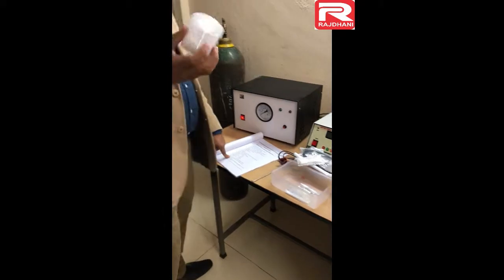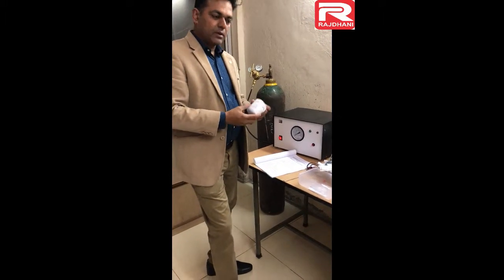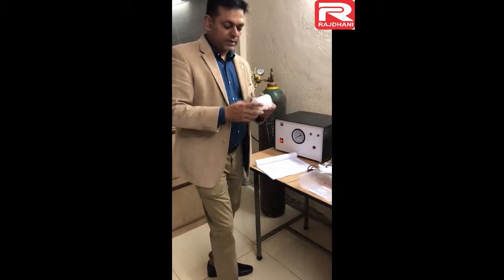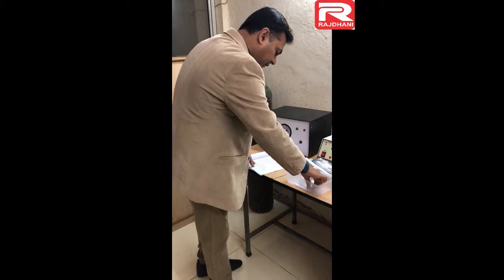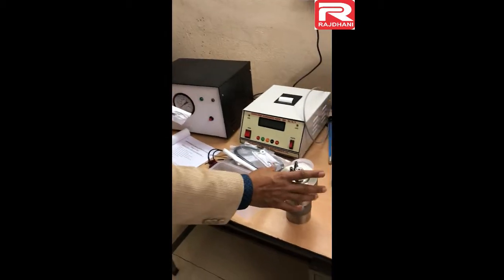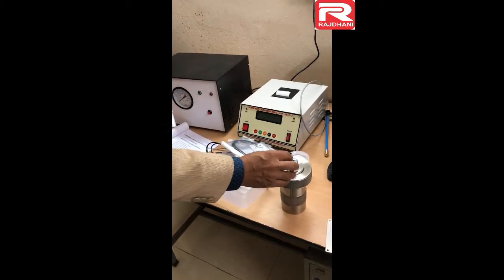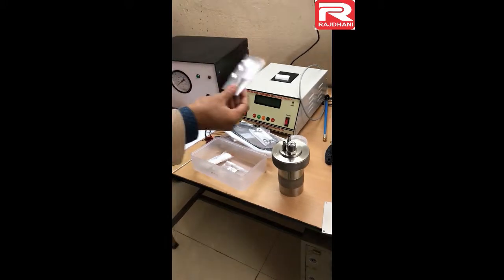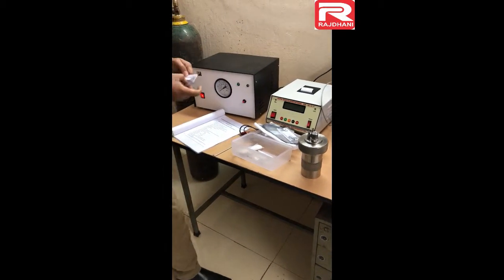The benzoic acid — its calorific value is also written on it — is used to standardize the bomb calorimeter. Benzoic acid is only used to standardize the bomb calorimeter. We provide this benzoic acid with a photocopy certificate from a testing laboratory which confirms its calorific value. The gas releasing pin is a small metallic pin. After completing the test, before opening the lid you must release the oxygen inside. You just touch this pin and slightly press it against the valve and the oxygen will release. Using this pin increases the life of the valve.